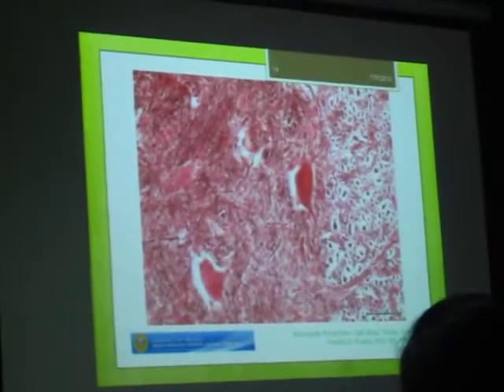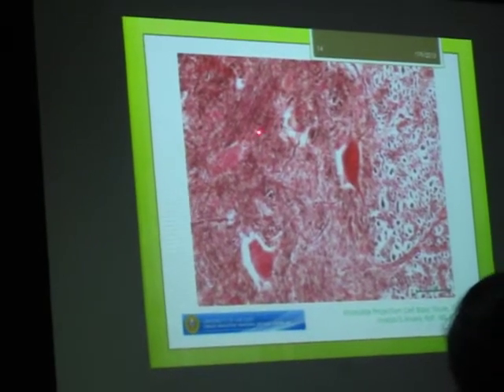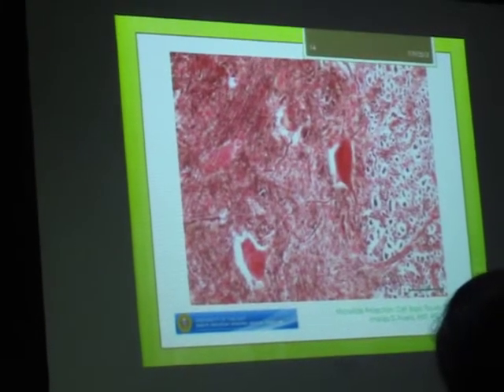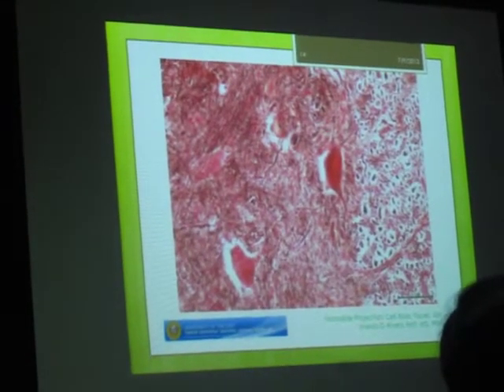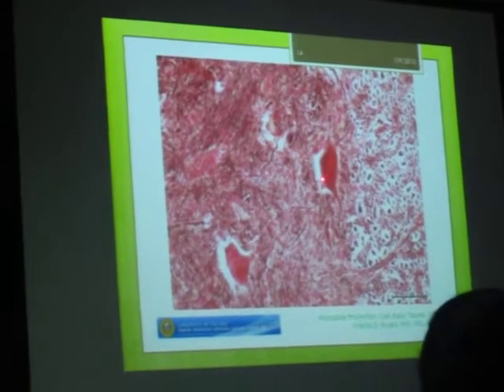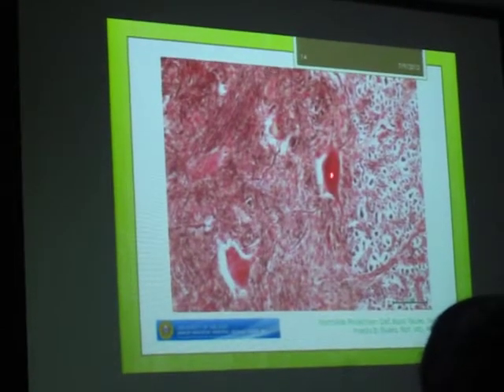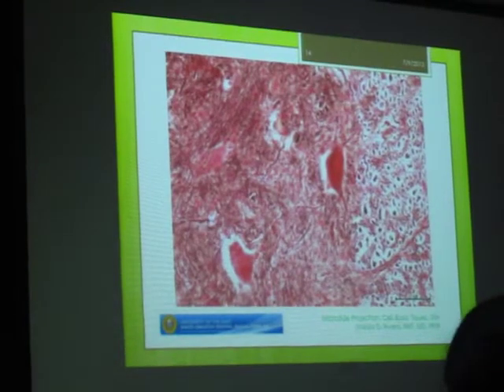Okay, what are the possible questions? Of course, we can ask you to classify the entire tissue. What is the answer? Nervous tissue. Okay, classify the pointed cell according to the number of processes. Multipolar. Or classify the pointed cell according to function.